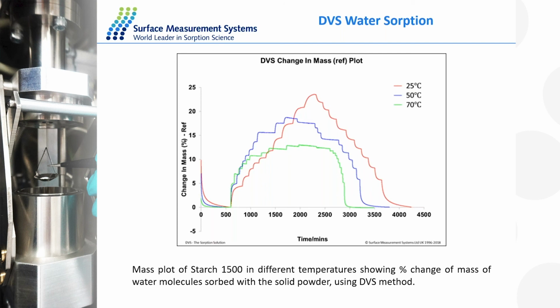So this is due to evaporative cooling, which you can't really do much about, but my colleagues are working on a heated reservoir at the moment, and watch the space. Soon you'll see a heated reservoir, which is meant to take this effect away, and this will be a pioneer technique as well.